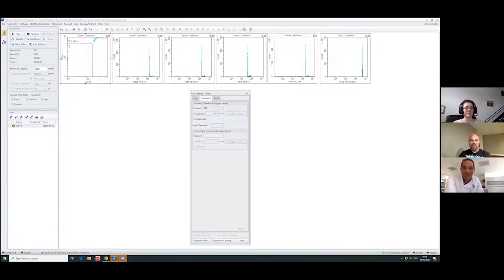It's very useful. Now, you have side scatter. So I have forward scatter, I have side scatter. So I will do just a couple of things before we move into the violet side scatter. That's something that John knows far more than me. Okay. I can give you the MEV 101, or maybe it's even 100. I don't even know if we got the 101 class.